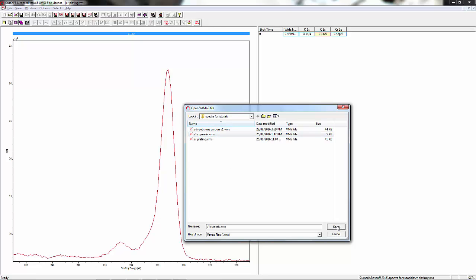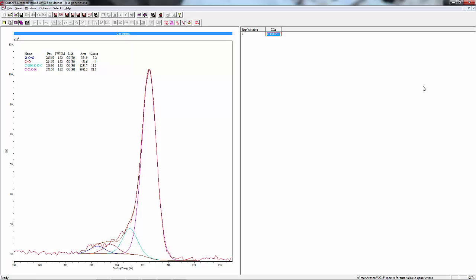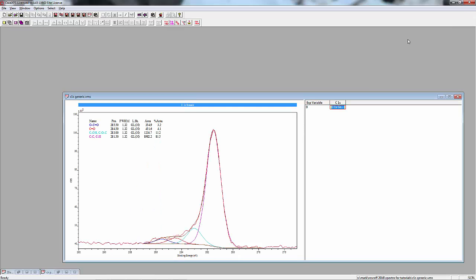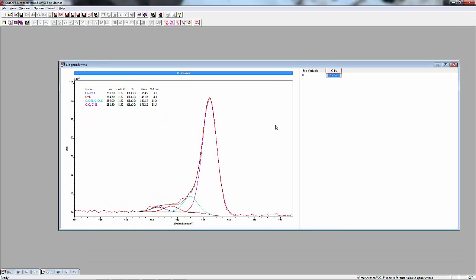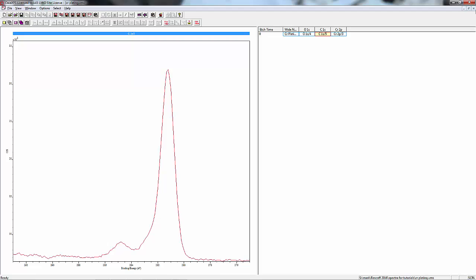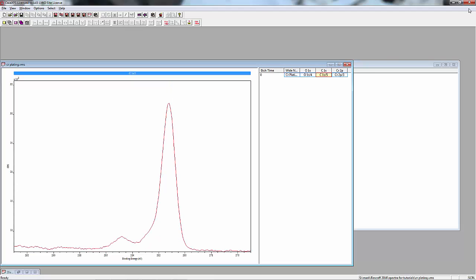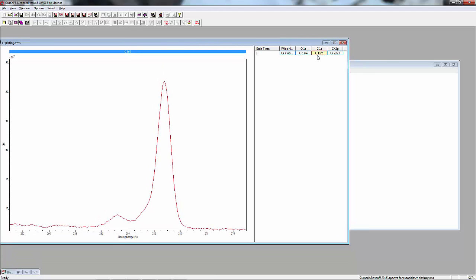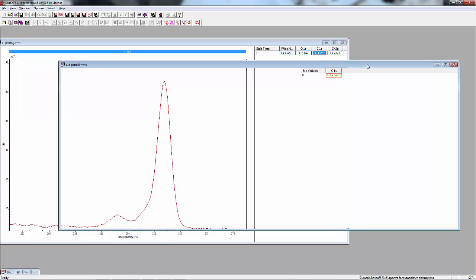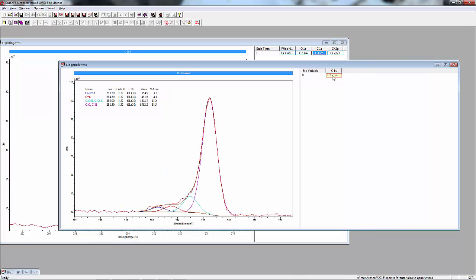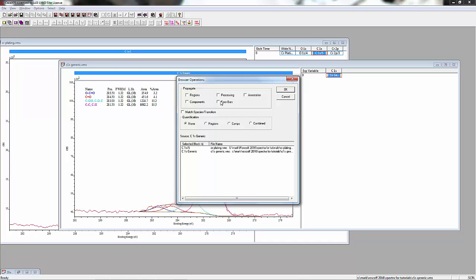Have the two windows open, and for this spectrum that hasn't been charge corrected, we're going to click on the carbon, hit Control-click on the carbon for the generic spectrum that we've set up, then right-click which brings up the browser operations.